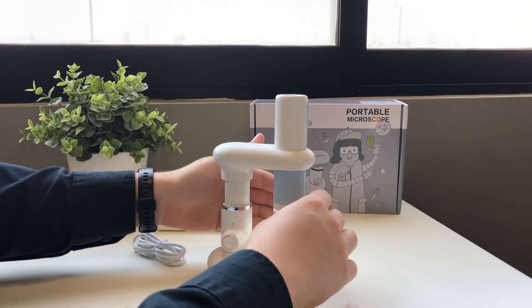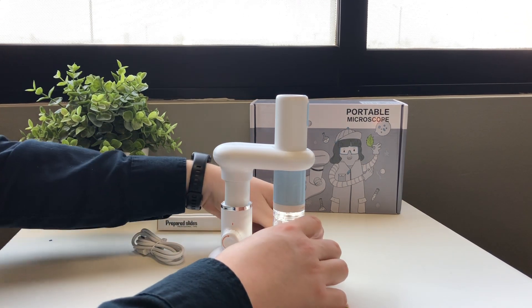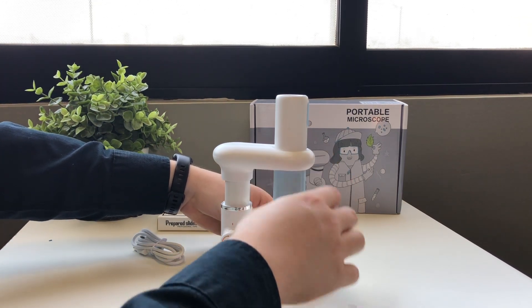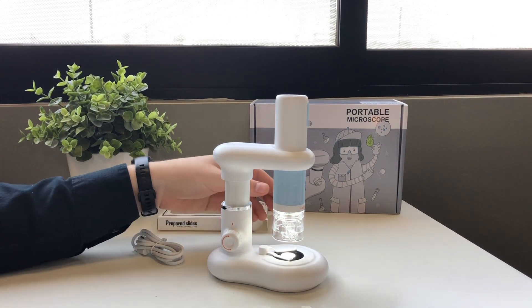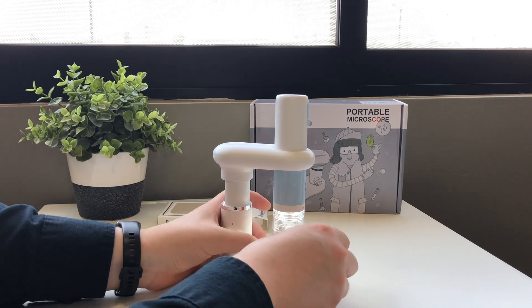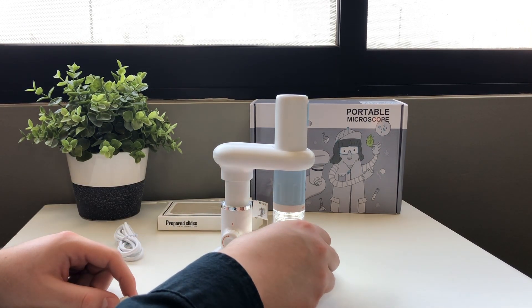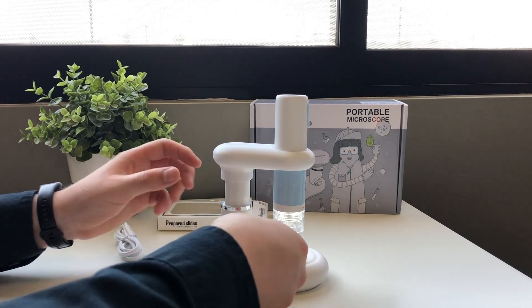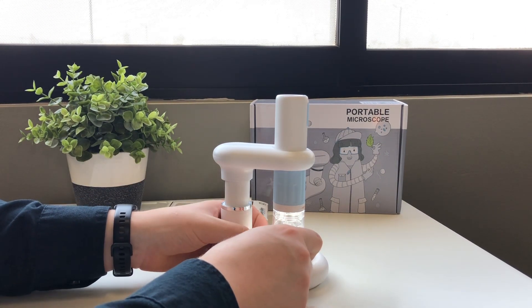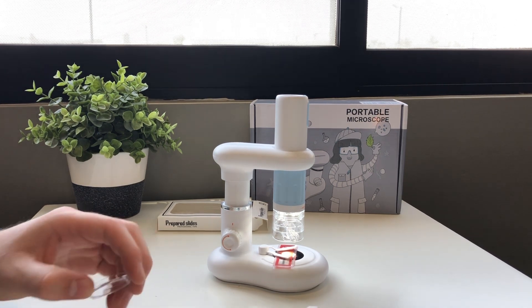We'll center it by side first, then secure it. Another thing is that you can turn on the light that lights here, so you can see better the things that you are going to see through the microscope. We'll get this off, set it on the center the best we can, put this clip on, and now we're going to see how it looks through the microscope with the magnification lens.